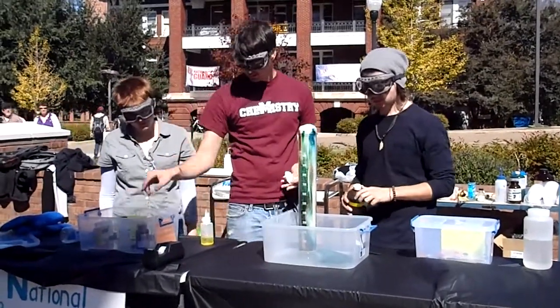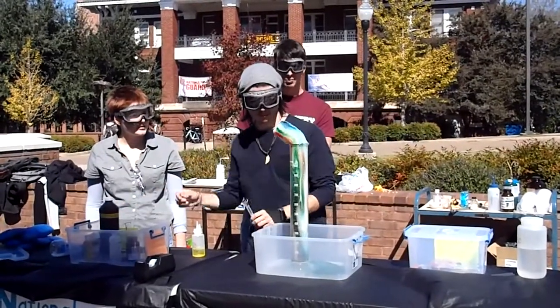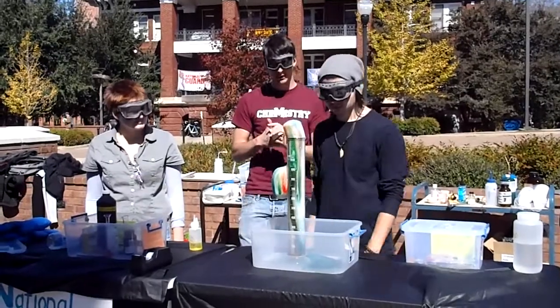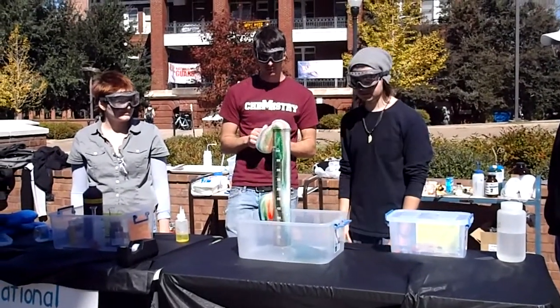The potassium iodide we put in the bottom is mixing with hydrogen peroxide and liberating the oxygen, which is giving us toothpaste. I'll only use it on your elephant, though — I wouldn't use it.